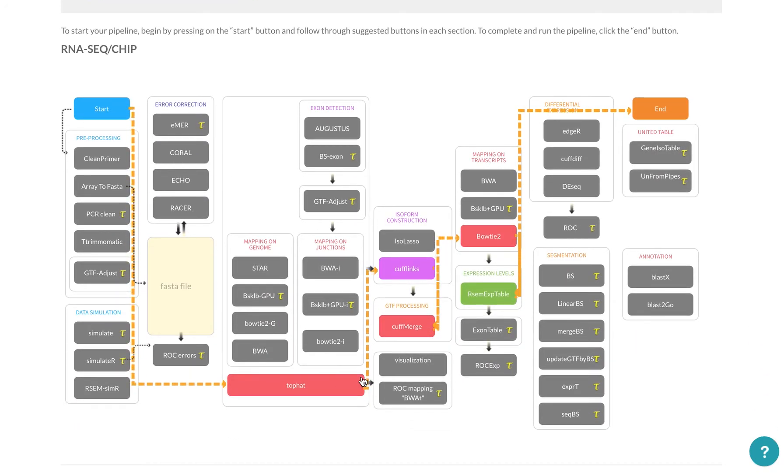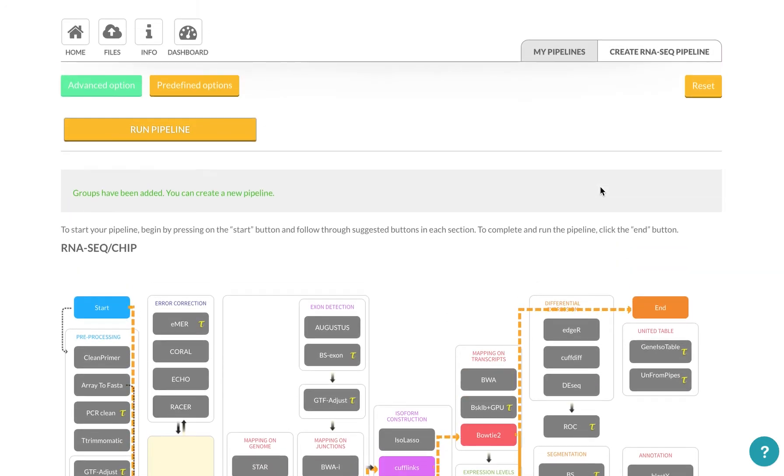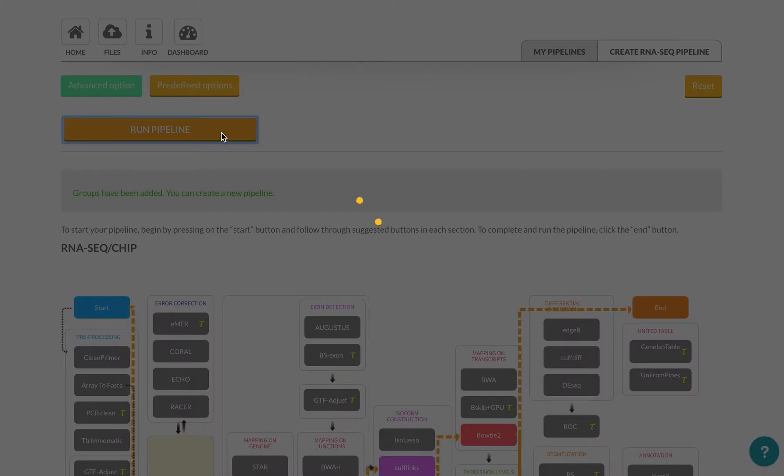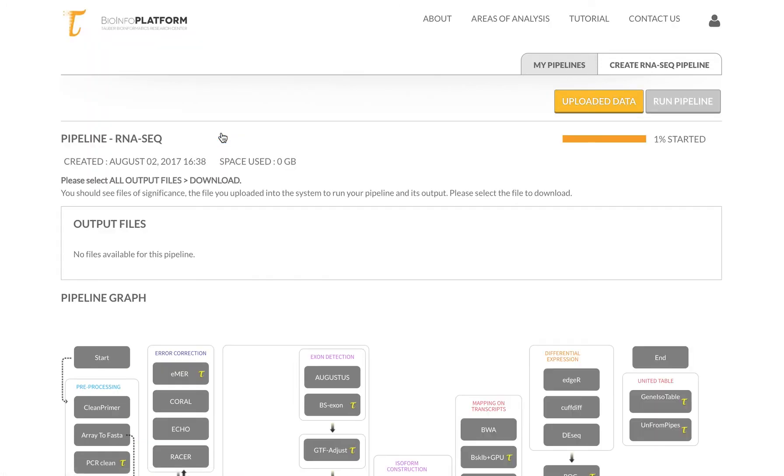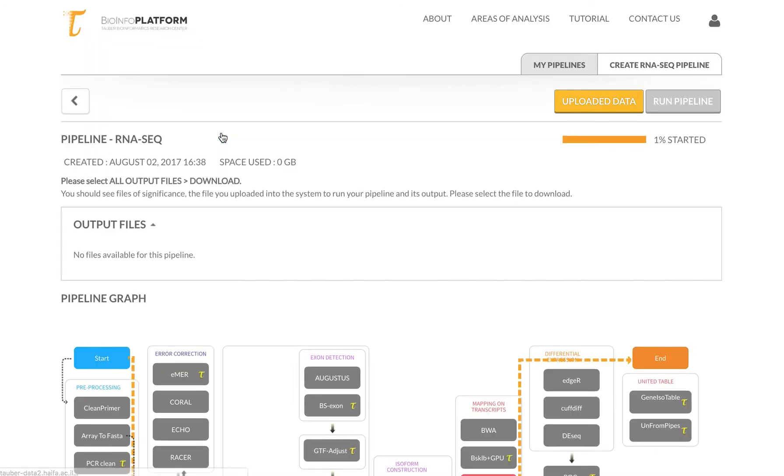So once I click the run pipeline button, I will be automatically redirected to the screen. You can see that the pipeline has started. And you can also see that there's no output files for now.